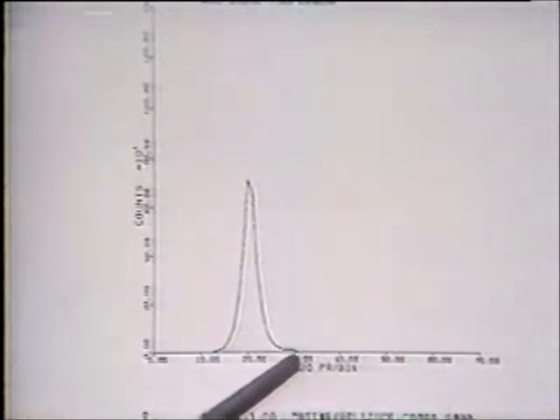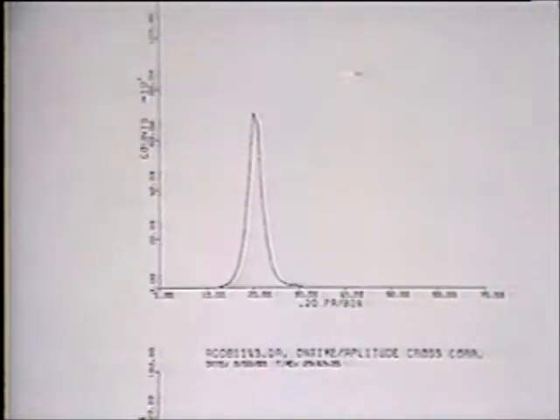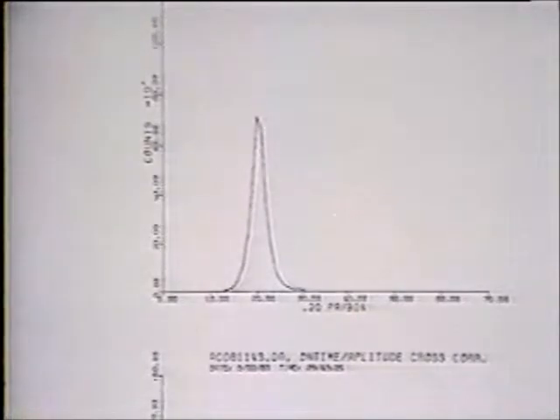If we calculate, instead of all points, the average amplitude of all points below threshold, you get this curve, which is narrower but has a little bit of a peak right over there. If we plot that same data as a cross-correlation plot of the average open time versus the average amplitude, it becomes much clearer.